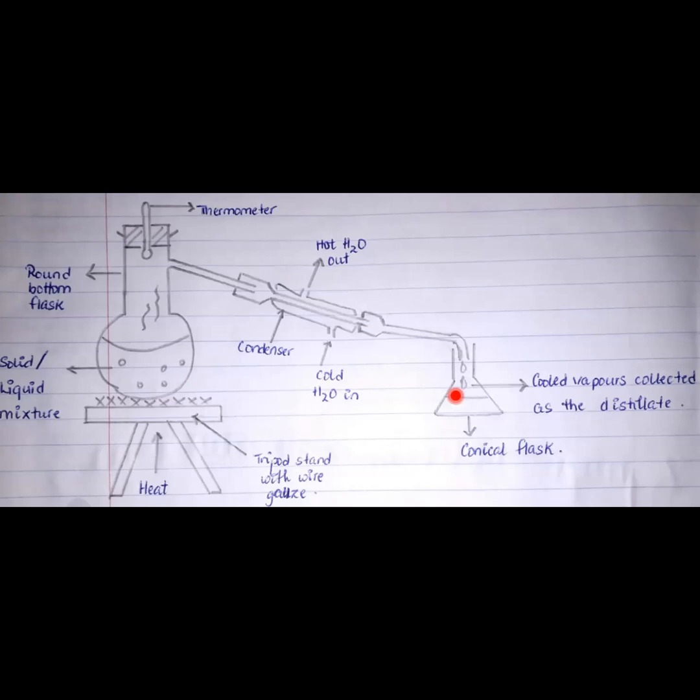So what's going to happen is, using seawater as the example, you put your seawater there inside of your round bottom flask and you start to heat it. Remember, you're changing between states of matter. So when you take a liquid and you start to heat it, it turns into vapor. So it's going to start to evaporate. That vapor is going to travel up to the neck of the flask and go through this little piece here and end up in the condenser.